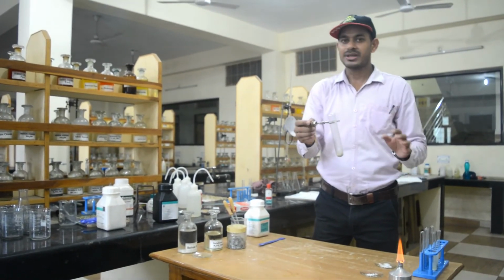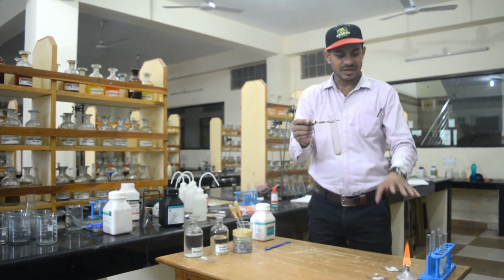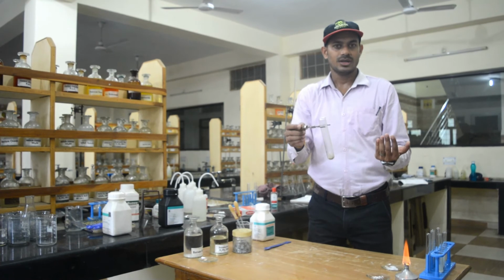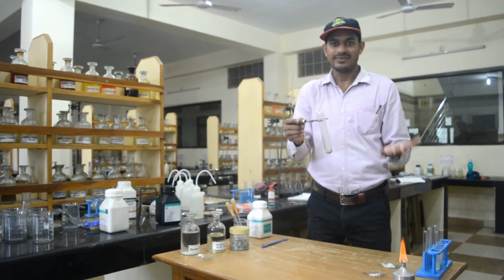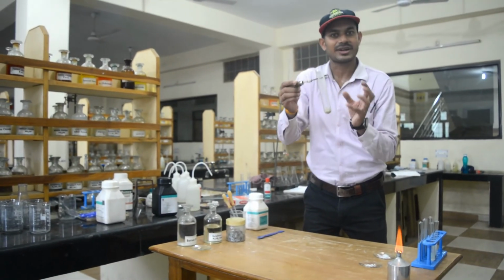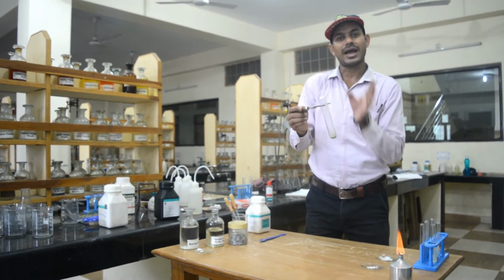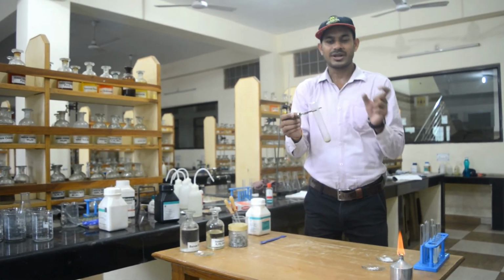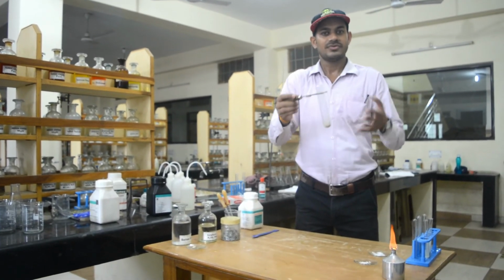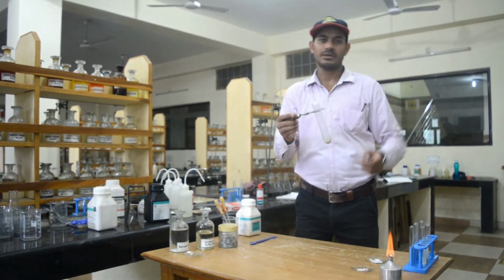One more thing: the ferrous sulfate that I have taken is a hydrated ferrous sulfate. When I am heating it, the water of hydration is evaporating. That's why the color is changing. So now I have got anhydrous ferrous sulfate. In this way, the ferrous sulfate and H2O molecules have been separated, and this is a kind of decomposition reaction where one molecule has broken into multiple molecules.